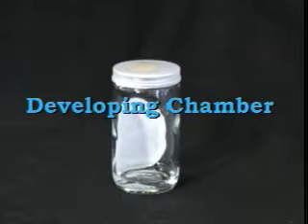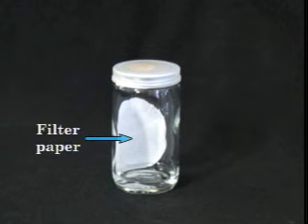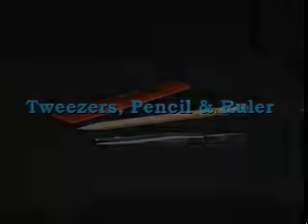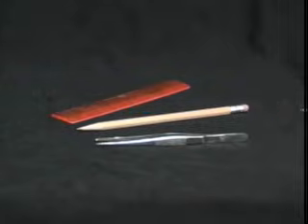Once a TLC plate has been spotted with a sample, it is developed in a developing chamber that can easily be assembled from a glass jar with a lid, a piece of filter paper, and 5 to 10 milliliters of an appropriate developing solvent. Before you get started, make sure you also have a pair of tweezers, a pencil, and a ruler close at hand.